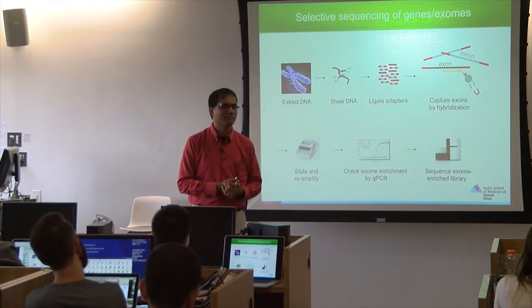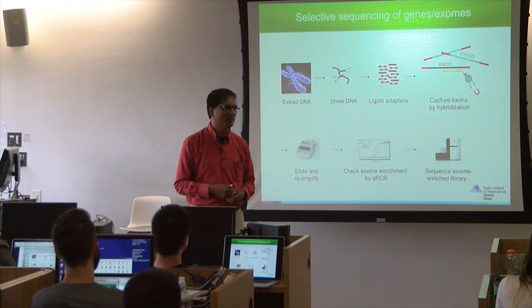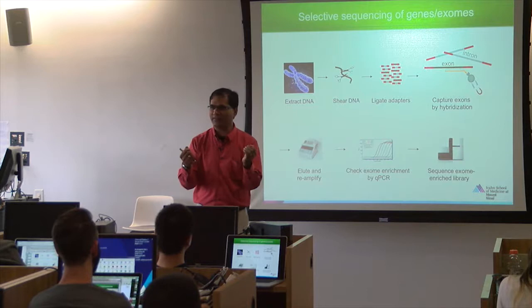If you are sequencing the 45 MB at 100x coverage, it will be 4.5 GB of data. But you are sequencing around 90 GB in one lane. Even at 100x, 4.5 GB is too little sequencing for that exome, so you are doing less sequencing.